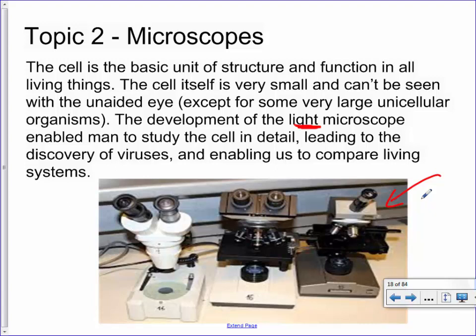But, I mean, if you have better and fancier microscopes, some of them might have, like, say, 2 lenses, and they'll converge together so you can keep both eyes open.